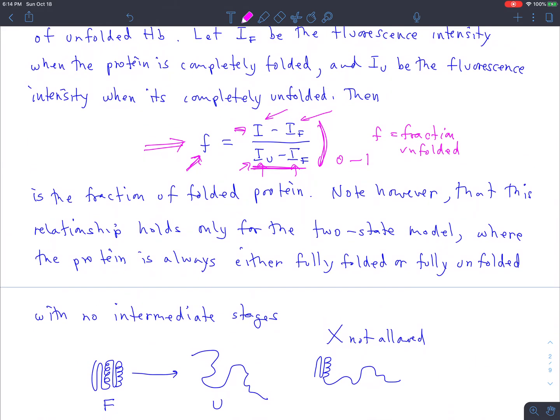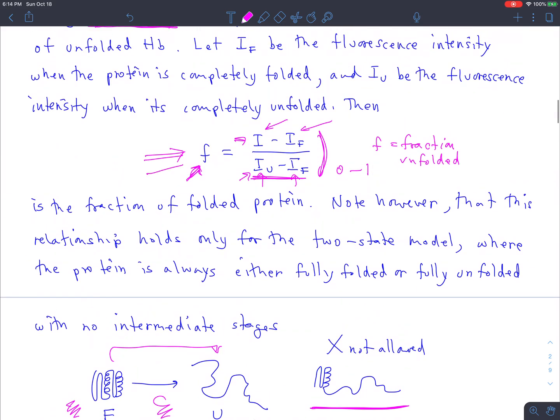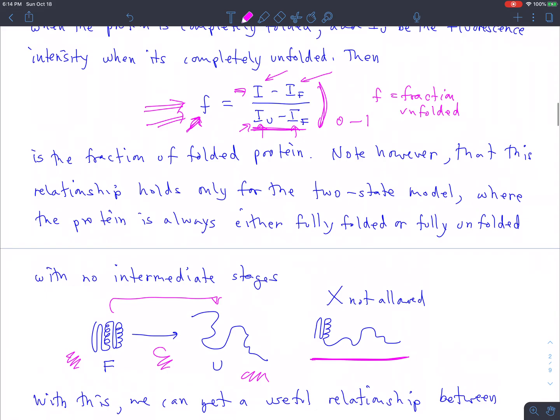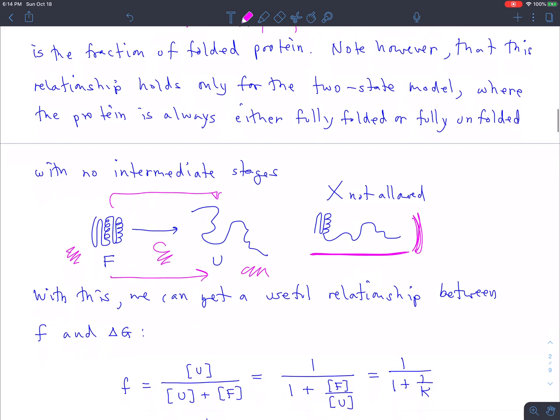If, that is, this relationship holds, if the protein unfolds in a single step. In other words, if you go from a fully folded protein to a fully unfolded protein with no intermediates in between. You have stuff like this happening, it partially unfolds, and then it unfolds a little bit more, and then it unfolds still a little bit more after that. Then this relationship won't be good, and our whole analysis will be bad. And if we get bad results at the end, and we got bad results last year, so I'm not sure that we won't get bad results this year too, then the fact that there may be intermediates between the fully folded and the fully unfolded state may be the reason. At least that's a good thing to put in your write-up, maybe, if you don't get good results.